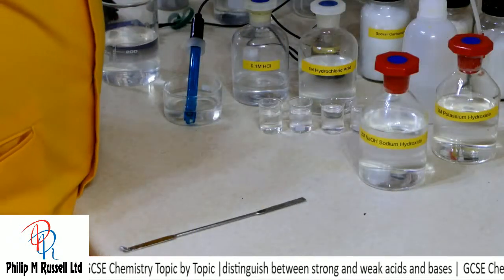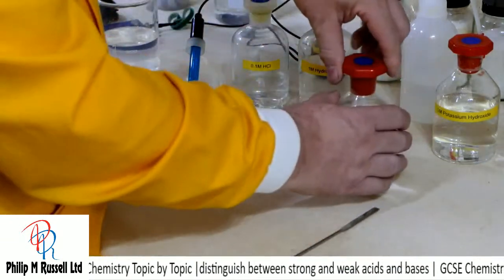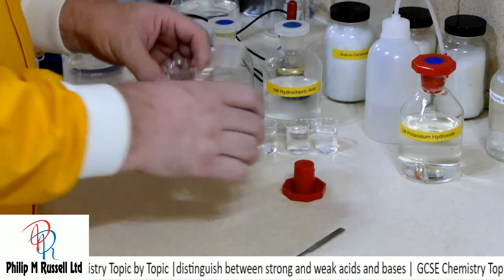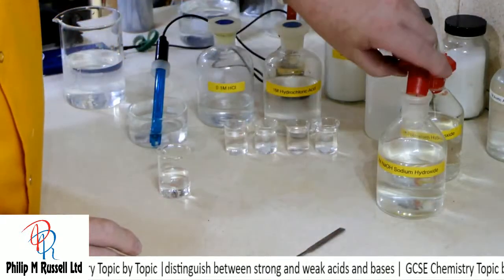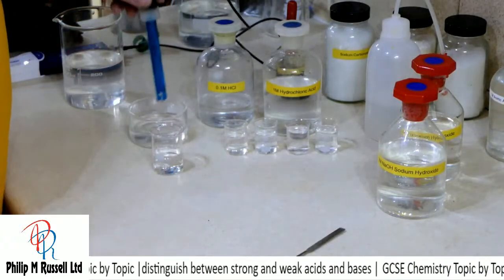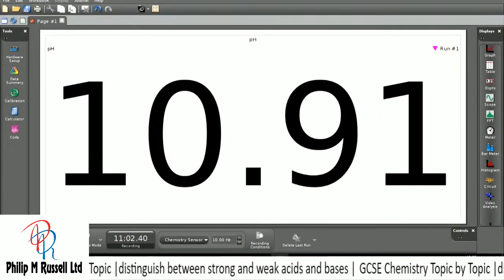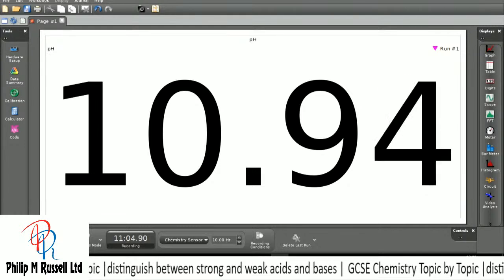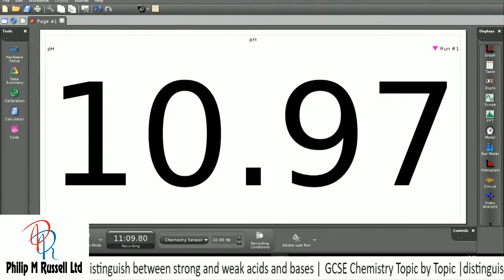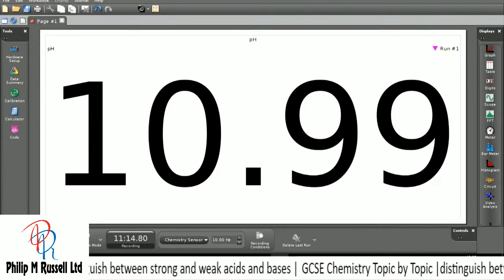And what I want to do is look at a little bit of, this time, sodium hydroxide. I've run out of little beakers. Let's have a look at this one. And that one, not quite as strong. pH 11, there we are.